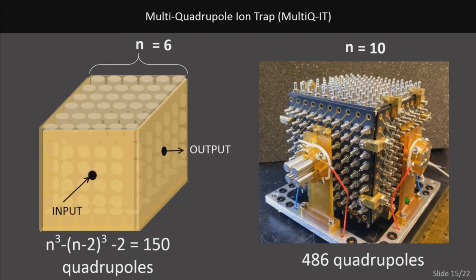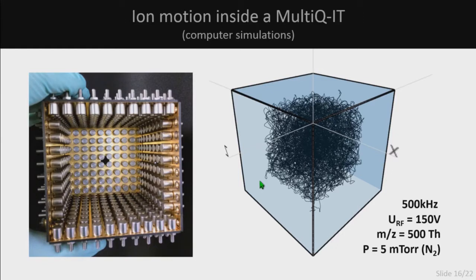For example, here I just showed you 2. But for ion depletion, we use all of them, and I'll explain it in a minute. Here is the ion motion and trajectory computed in such a device. You can see that a single charged ion with the parameters indicated can be stably maintained for more than half a second.